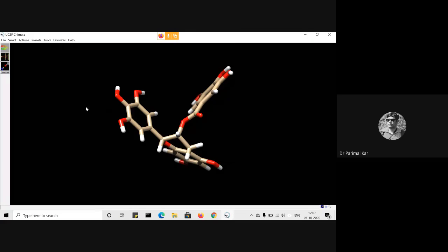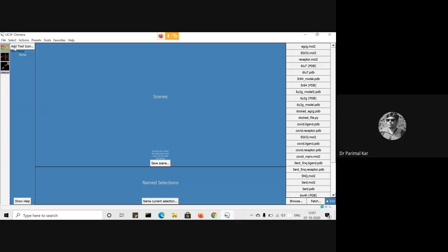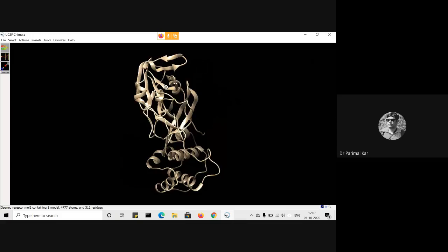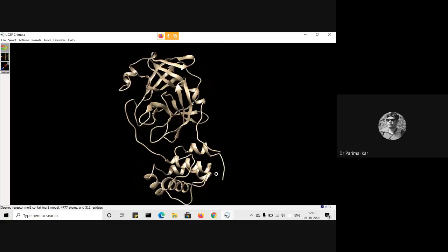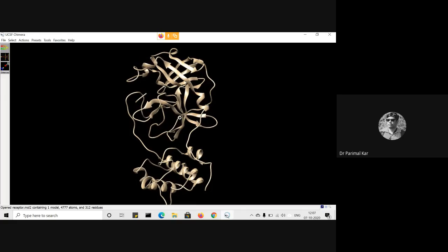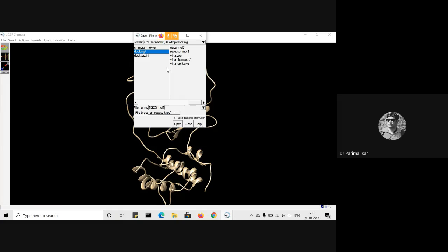Okay. Fine. Now close this session and open the receptor mol2. This is my receptor. Okay. And this is mol2.